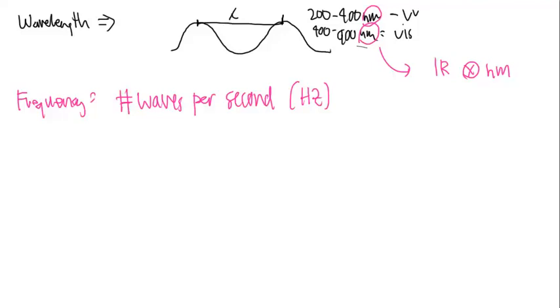But very rarely do we talk about nanometers when it comes to infrared spectroscopy. Now, that does not mean that we can't assign nanometers to it. Of course we can. The problem is that the numbers become quite large because infrared is a very large region. And because of that, we change the unit from nanometer over into something else.